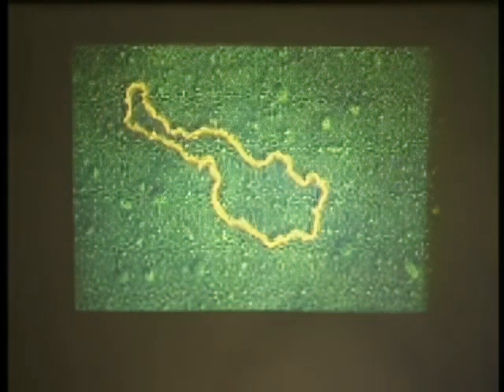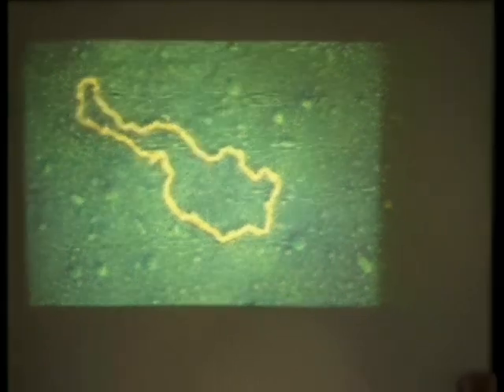So you're getting down to the level of seeing molecules with an electron microscope on a benchtop. It's not a huge device we're talking about. This is a relatively small size electron microscope capable of probing down to distances of the order of molecules.